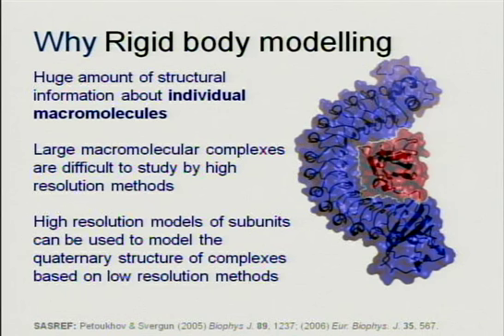Typically, if you ended up with SAXS while studying your protein, you want to have information about either a complex or a multi-domain protein, and there is information from the individual macromolecules already available. Either single domains of the protein were solved by other methods, or you can find a structure of a domain which has a similar amino acid sequence.